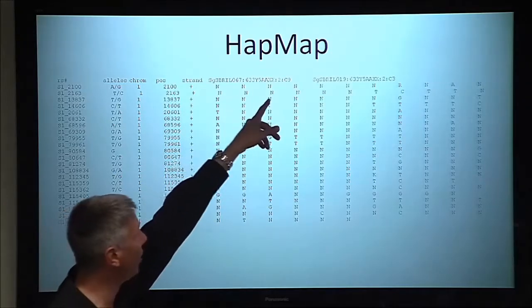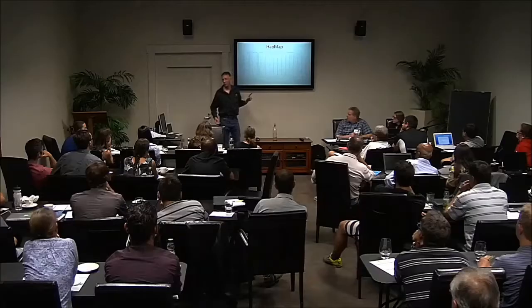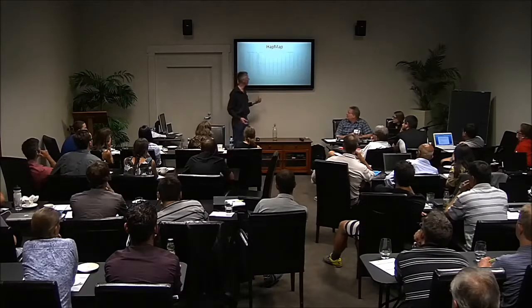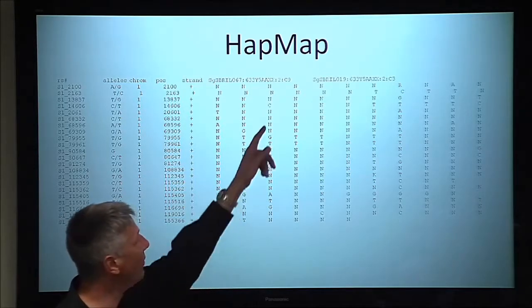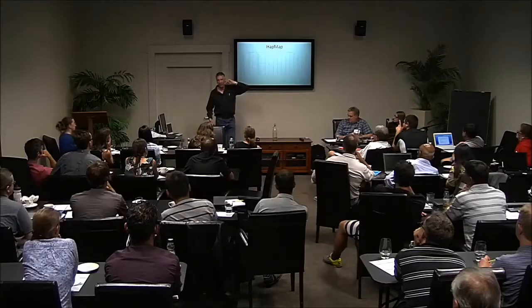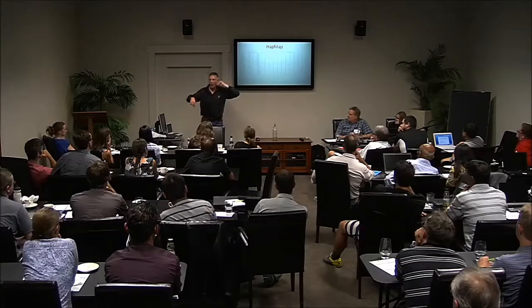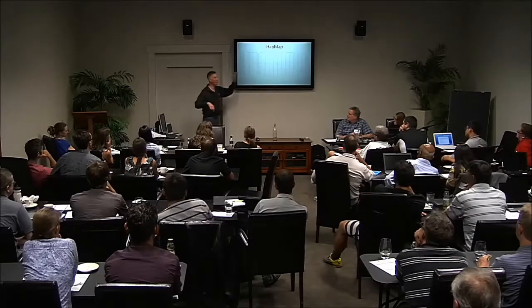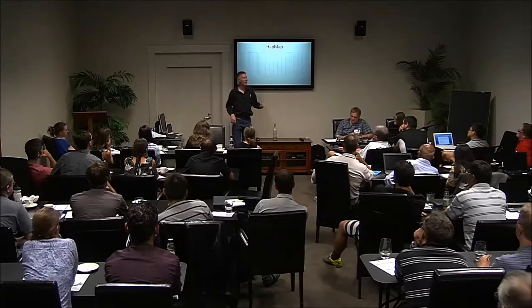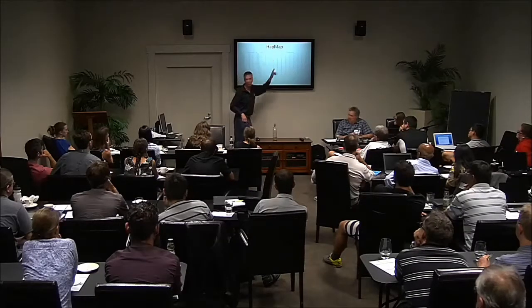And then a colon and 2. Anybody want to guess what the 2 stands for? Lane. The lane. Spot on. And then there's a colon C9 in this case. Plate position. And that's used if there isn't a library prep ID. If there is a library prep ID, that shows up in the name too.